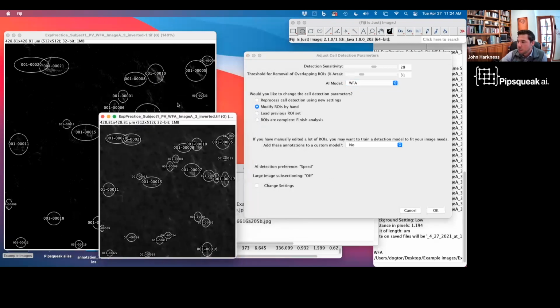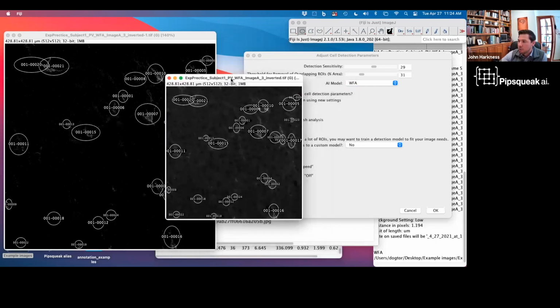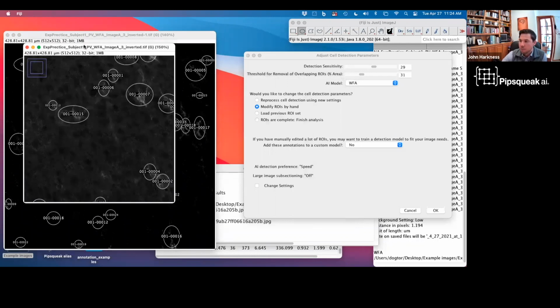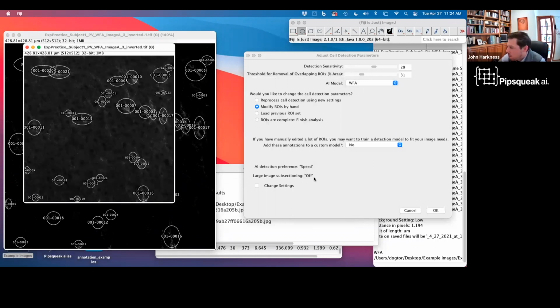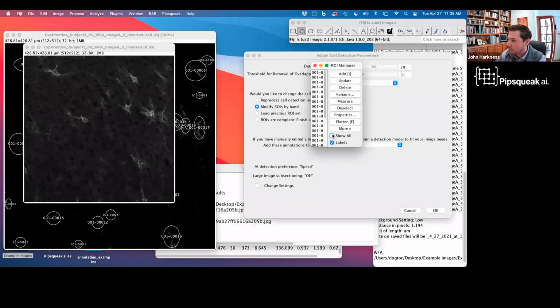And actually, one of the other good questions that comes up quite often is, why do I see 2 versions of my image? This is basically showing you your raw image here. This is not background subtracted, and over here I have background subtracted. This is something that we're probably going to make a little bit more streamlined in the future, but right now you can see both. And sometimes I like to see one versus the other. In this case, if I'm going to go through and look for these WFA cells, I don't think my background subtracted image is actually the one that I want to look at, because some of these WFA cells become pretty dim. So, I tend to look over here at my original image because, when I look at those WFA cells, or the perineural nets, I keep calling them WFA cells, when I look at them, it's much easier to see.